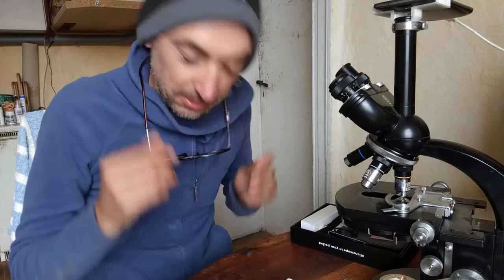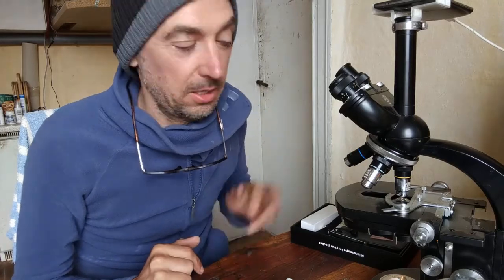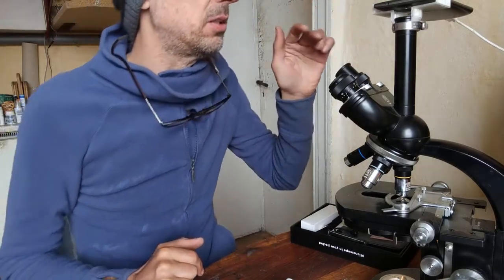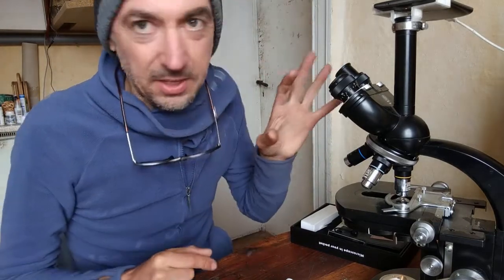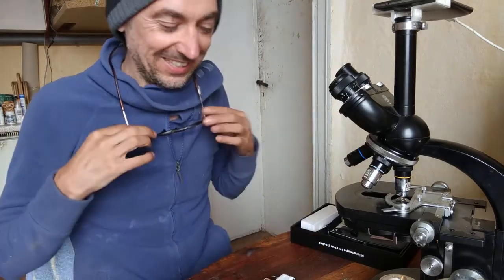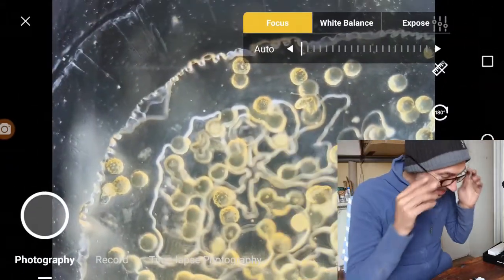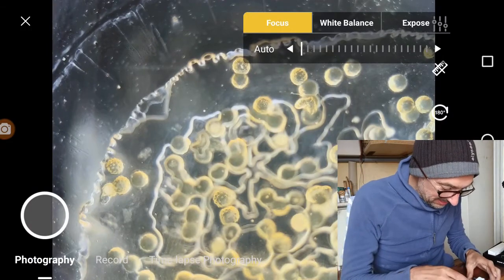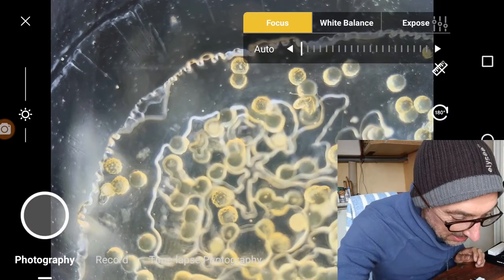To get an idea of the quality, I compared it to a 10x optical objective and a 40x objective. I think there's also a 10x or 12x eyepiece, so it's 100x to 400x magnification versus this. I've chosen pollen for right now.